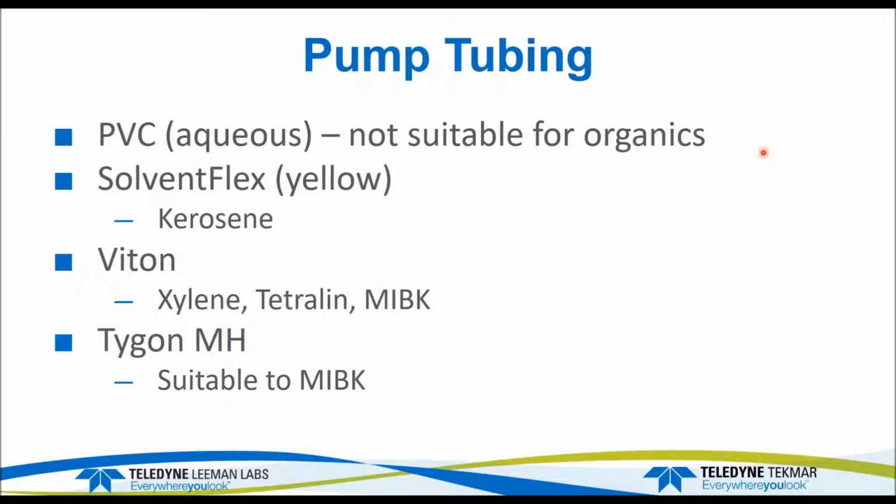There's a material called Tygon MH. The only source of it that I know is Glass Expansion, and I've used that for MIBK. It really works well. It's somewhat costly tubing, but you can run MIBK for a few days and it'll still work really well. So sometimes the limiting factor on the solvent that you're using is what we can use for pump tubing.